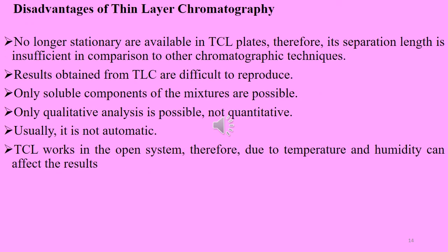There are certain disadvantages of thin layer chromatography. There is no long stationary phase available in a TLC plate. Therefore, its separation length is insufficient in comparison to other chromatographic techniques. The results obtained from TLC are difficult to reproduce. Only soluble components of the mixture can be analyzed, and qualitative analysis is possible but not quantitative analysis.